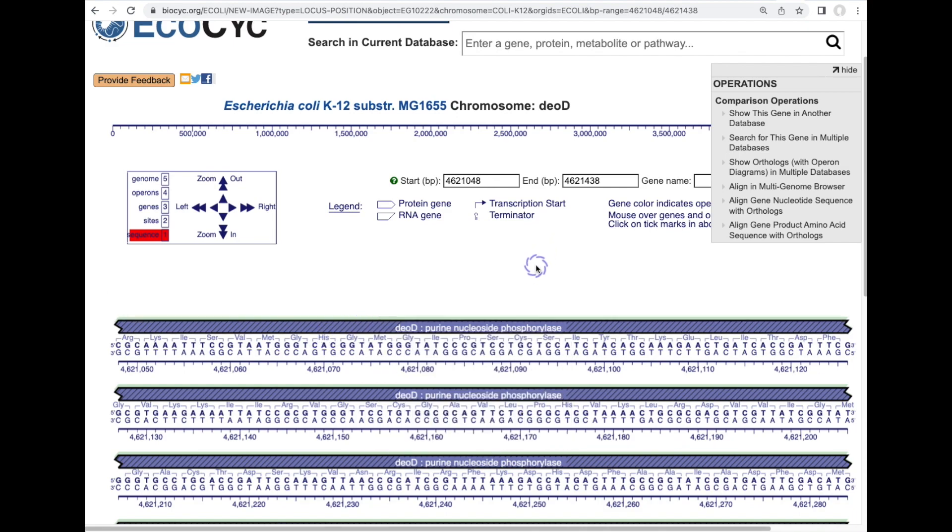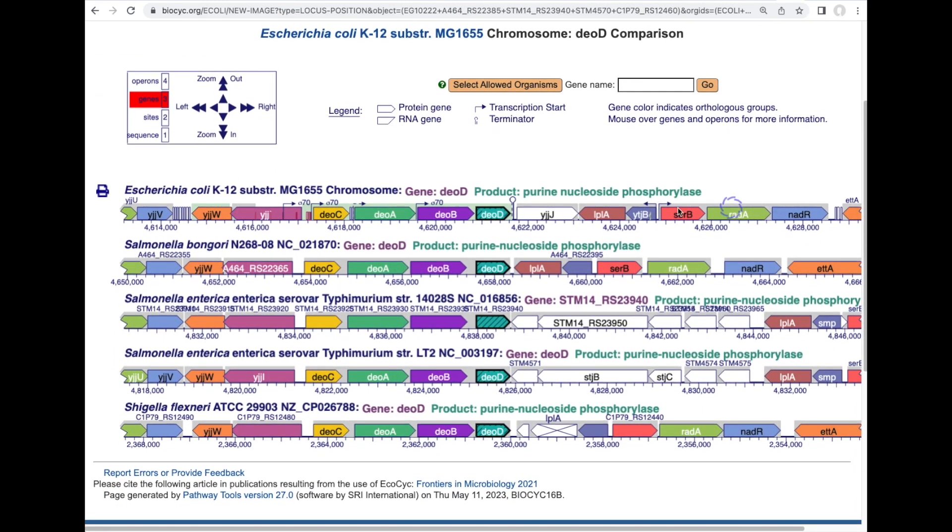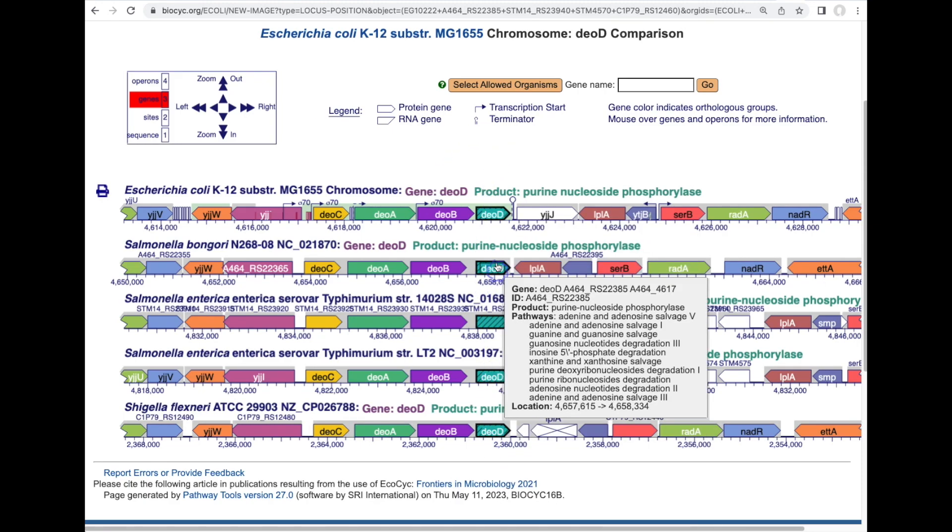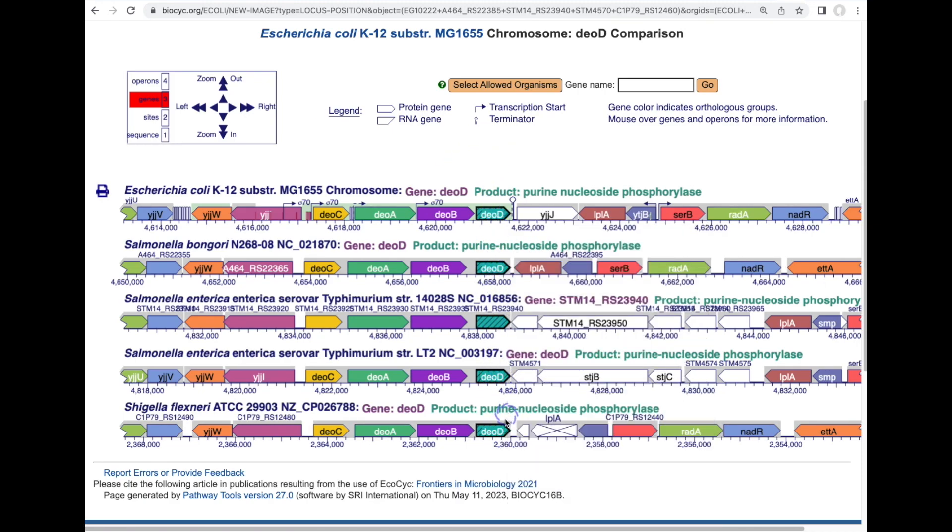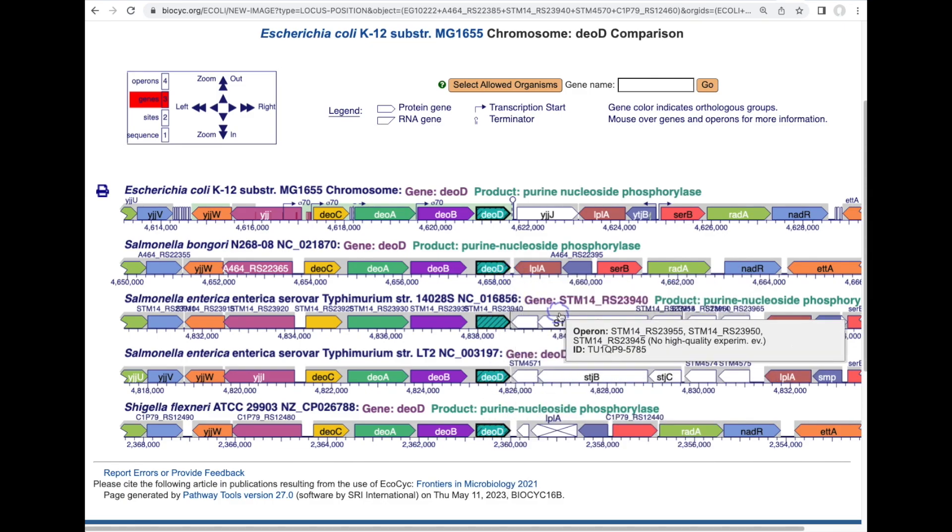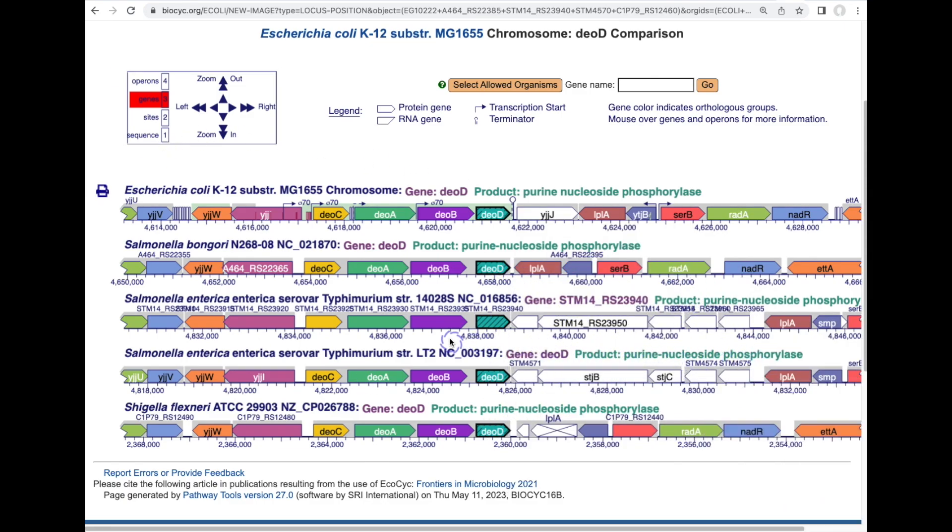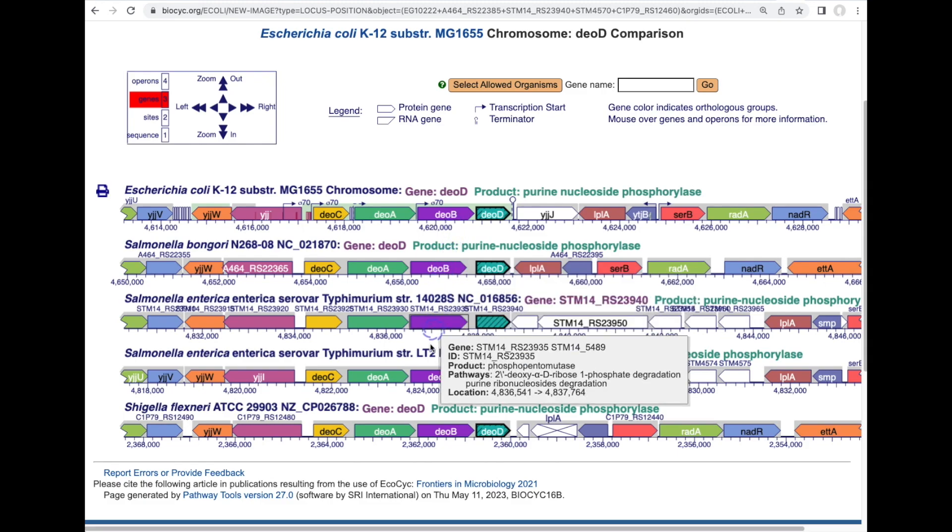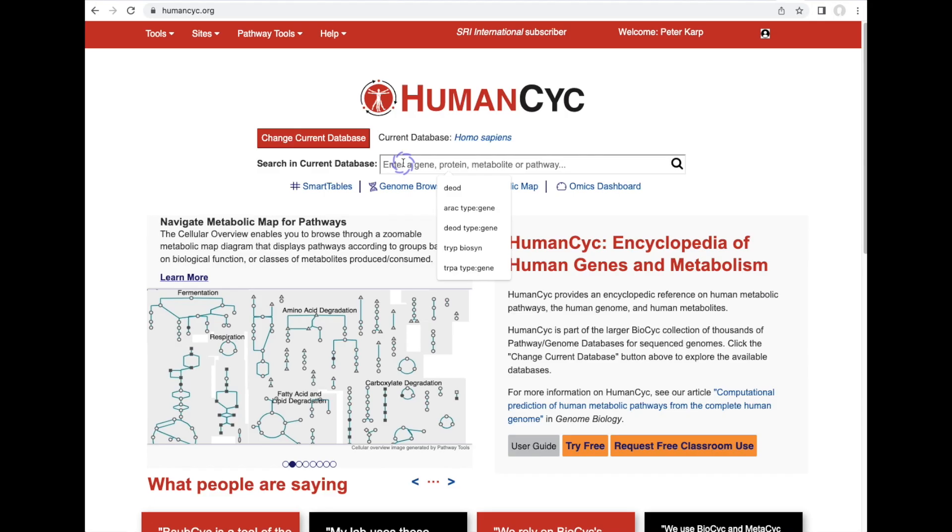We can also use the genome browser in a comparative mode. Here the comparative genome browser aligns five different genomes at the DEOD gene from E. coli K12 and its orthologs in the other genomes and shows the surrounding genome regions with orthologs drawn in the same color.